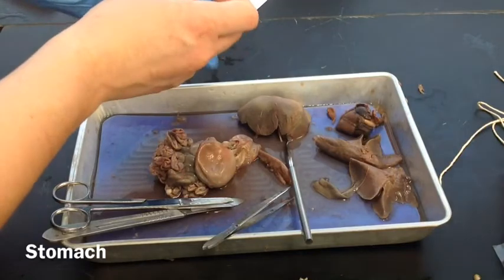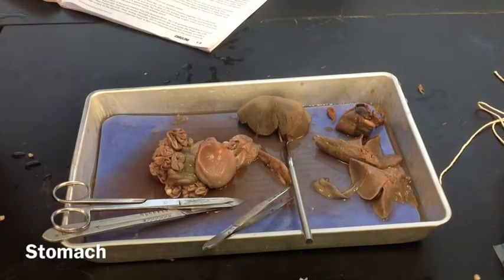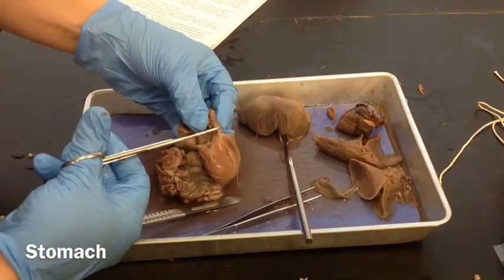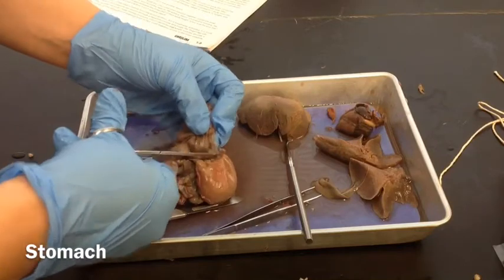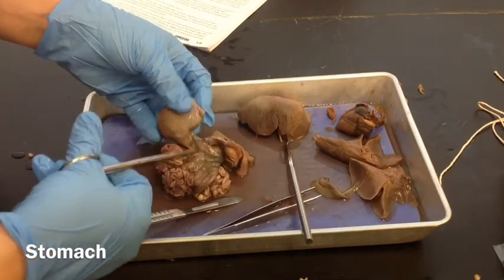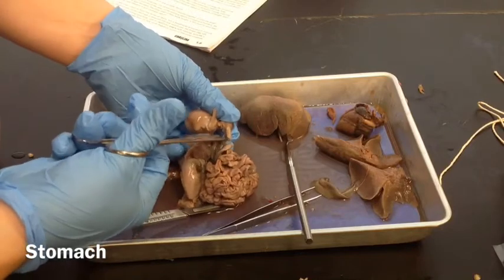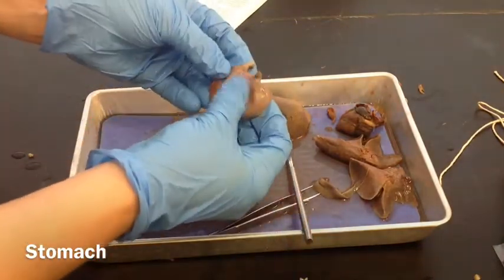We're going to remove the stomach by cutting the esophagus on the top end, right above the cardiac sphincter. You can feel right at the top of the stomach — it's a little bit harder right there, and that's the cardiac sphincter. So we're going to cut the esophagus there. It also tells you to cut at the small intestine at the base after the pyloric sphincter. This is the pyloric sphincter where it enters the small intestine, so we're going to cut below that right there. There's your stomach — that's where it goes in, turns all the food for a couple hours, and then it comes out into the small intestine.